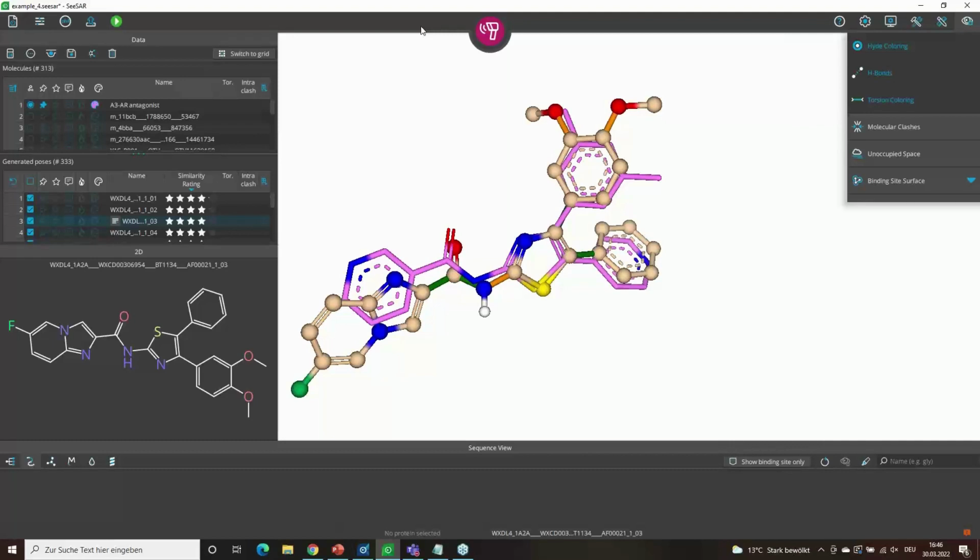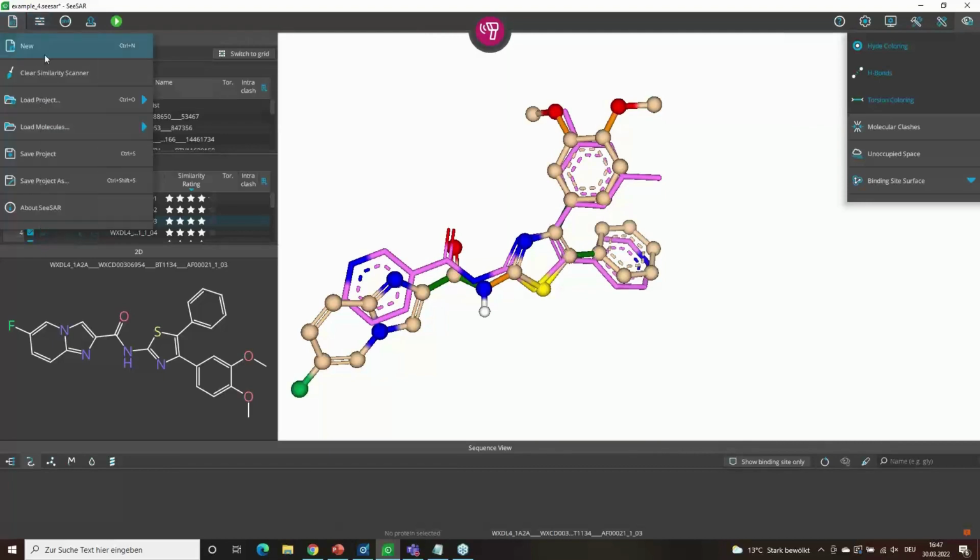Okay, I think the other questions are a little bit more exciting. So I will now switch over to three examples of X-ray crystallography, to give you an idea how well it performs.